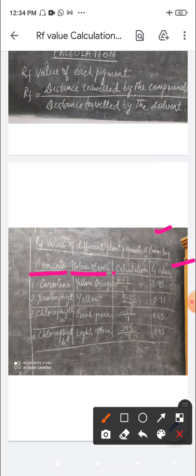The topmost position is yellow-orange in color, which indicates the presence of carotene. The distance traveled is 6.67. We divide that — the distance traveled by the compound — by the distance traveled by the solvent, which is seven. So the RF value is 0.95.